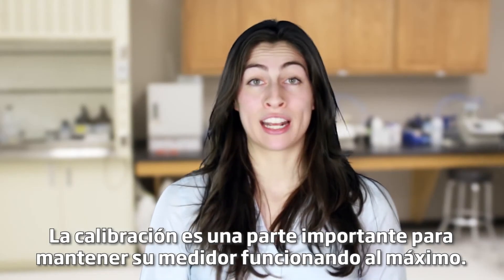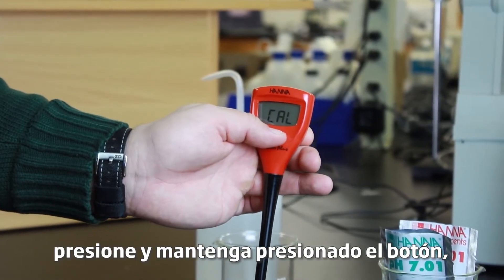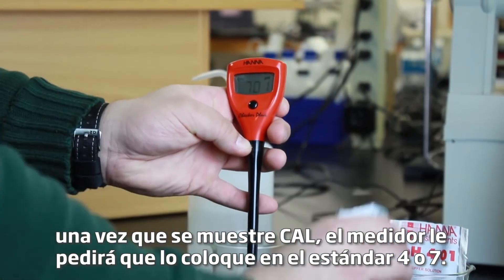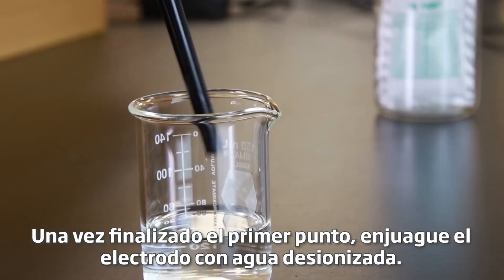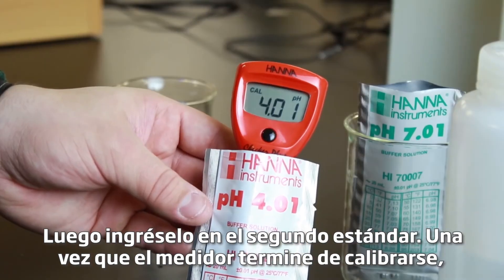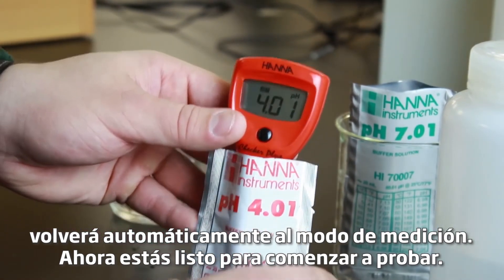Calibration is an important part for keeping your meter operating at its best. We recommend you calibrate before each use. To calibrate your meter, press and hold the button. Once cal is displayed, the meter will prompt you to put it in either four or seven buffer. It will automatically recognize which buffer you use first. Once the first point is done, rinse the electrode in distilled water, then enter it in the second buffer. After the meter is done calibrating, it will automatically return to measurement mode. Now you're ready to start testing.